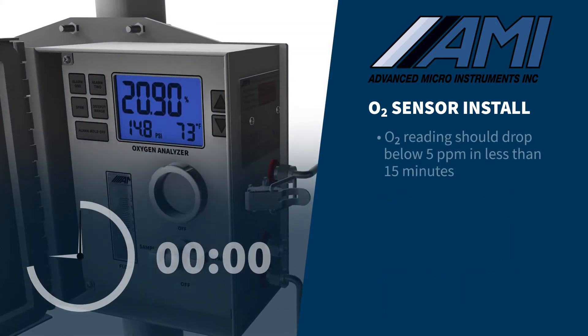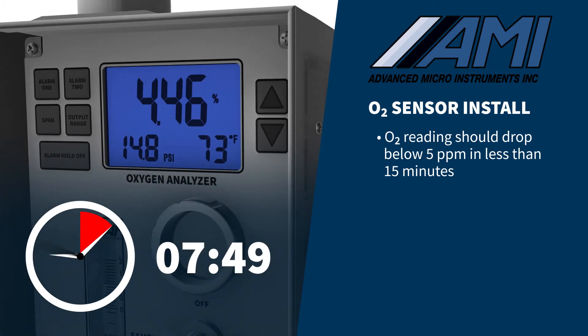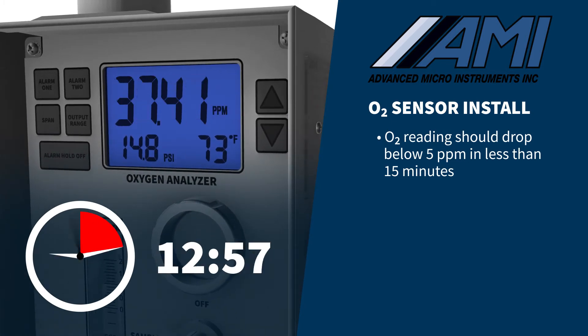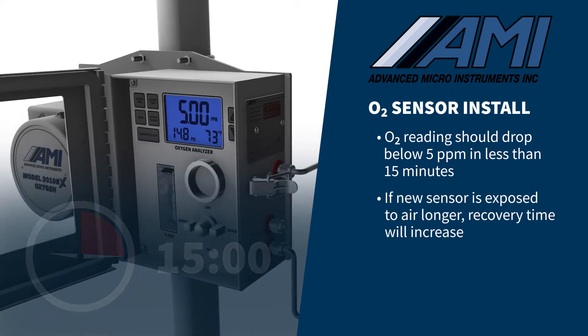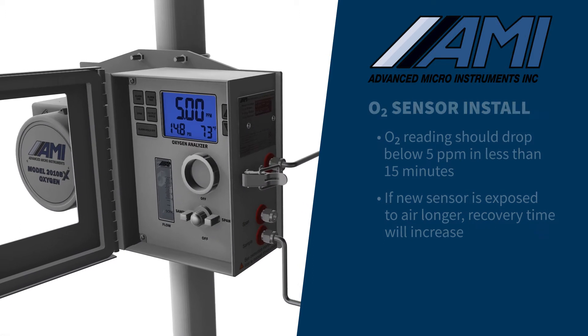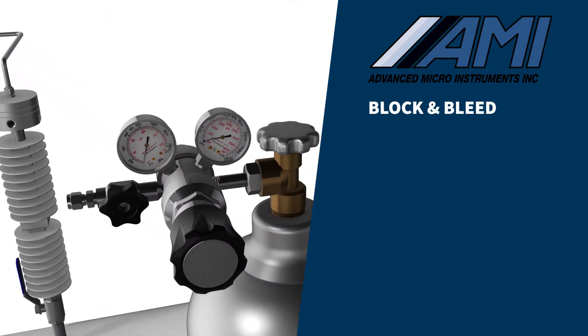If this procedure is followed, the oxygen reading should drop below 5 ppm in less than 15 minutes, providing the pipeline gas has less than a few ppm of oxygen. If the new sensor is exposed to air longer, it will increase the sensor's recovery time. While the sensor is recovering from the exposure to air, you should perform the block and bleed process of the regulator.